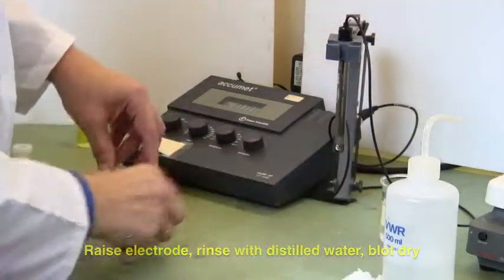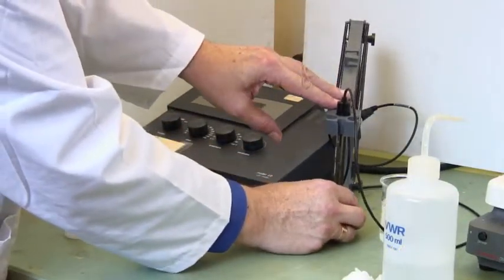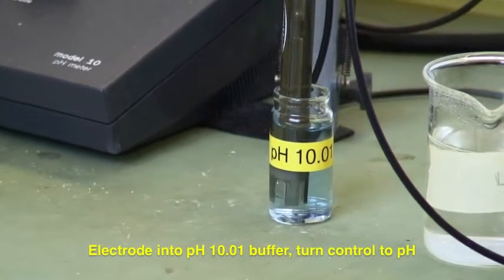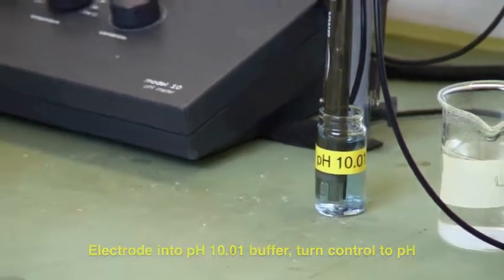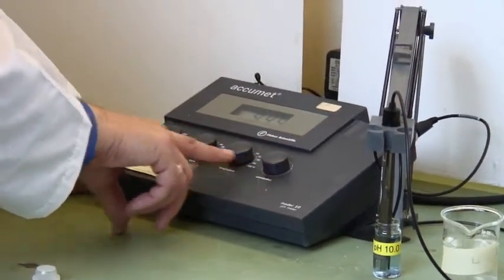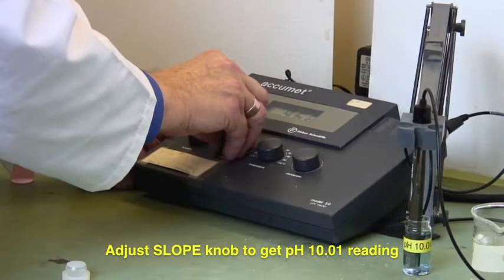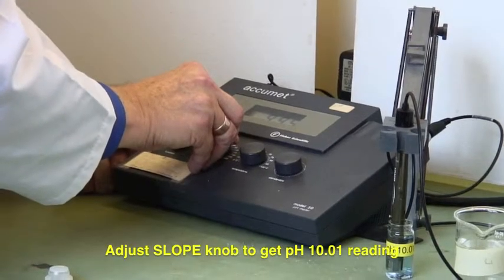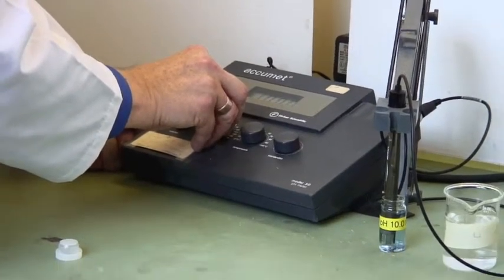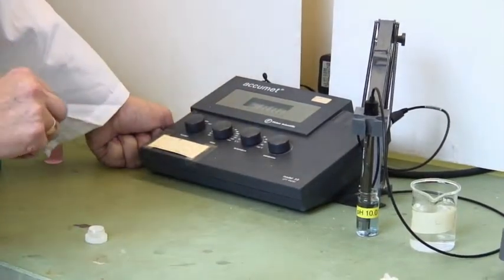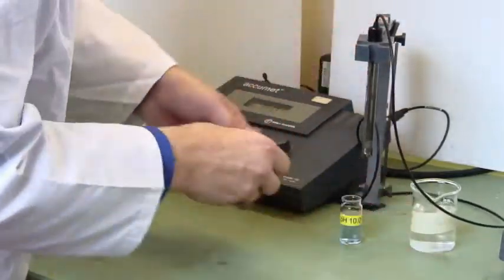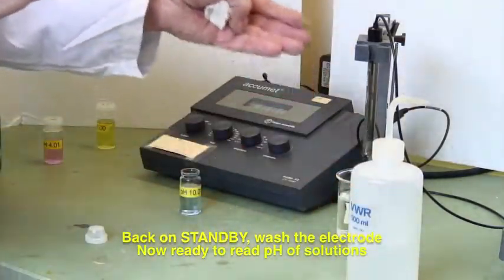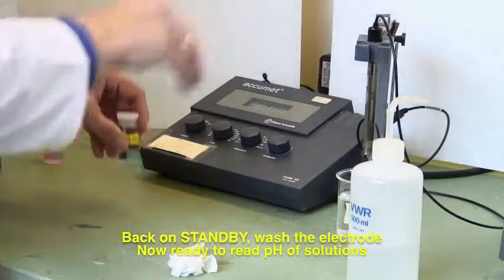Blot it again, and we're now going to put it into pH 10. Now at this point, we put it onto pH, and instead of using standardize, we're going to use the slope to adjust this until it gets to 10.01. And so we adjust this until we're getting to 10.01. There we go. Put it on standby, and again lift up, wash the electrodes off, and we're now ready to take pH measurements using this machine.